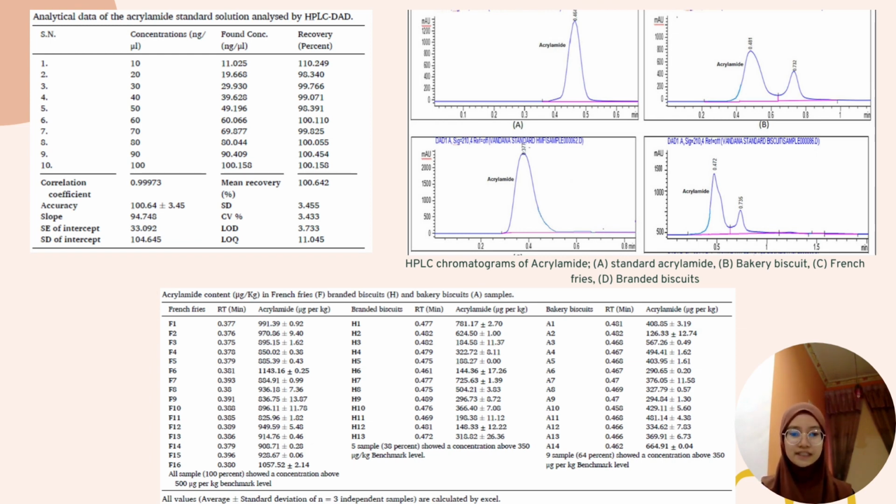For the graph in A, the retention time for the acrylamide standard is 0.464, and for graph B, the retention time of acrylamide in the sample bakery biscuits is 0.481. For graph C, the retention time of acrylamide in the sample French fries is 0.377, and the last one, graph D, the retention time of acrylamide in the branded biscuit is 0.472.